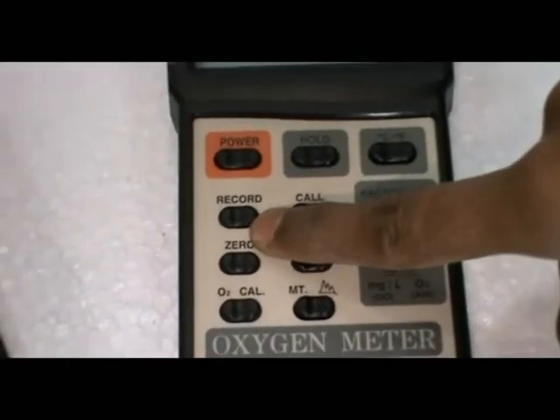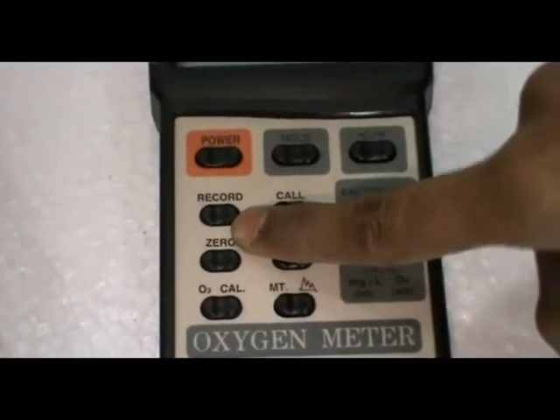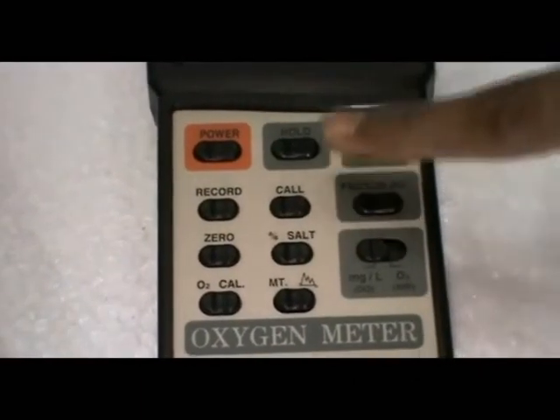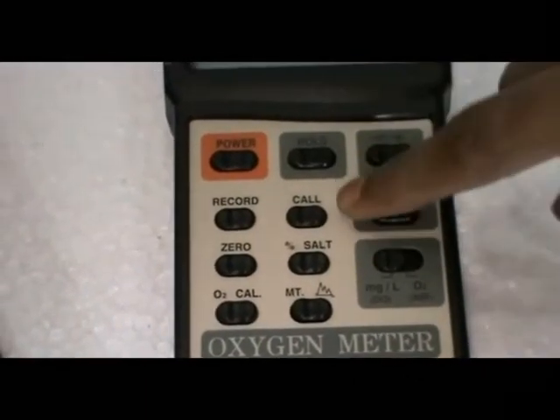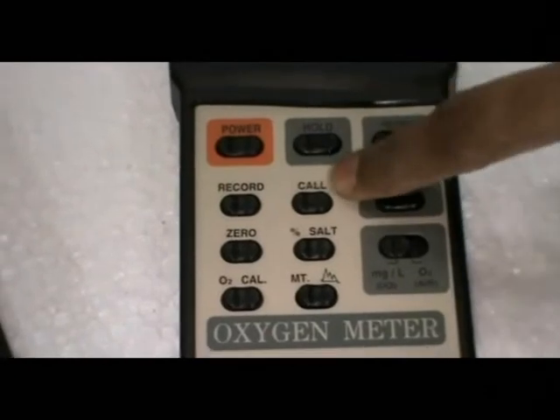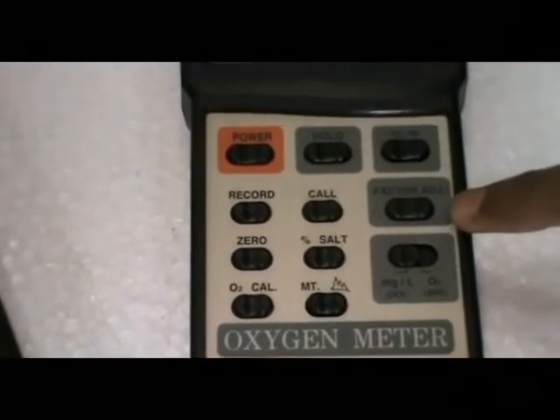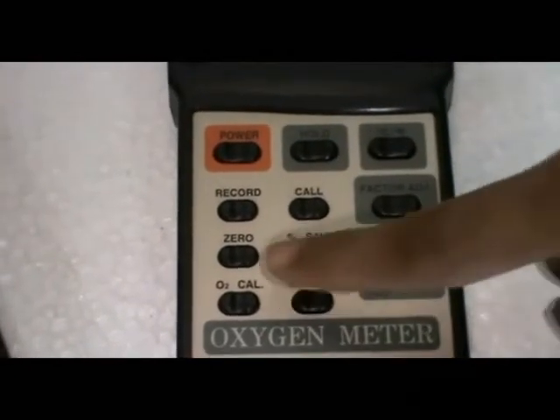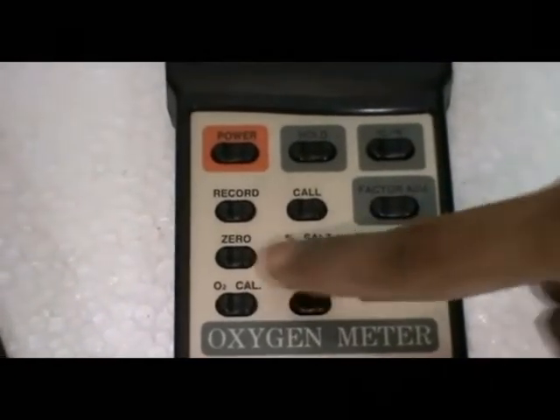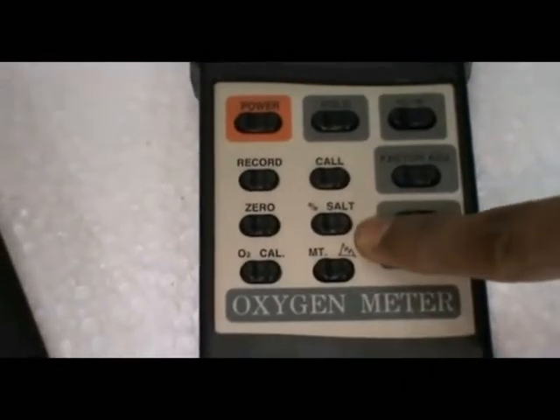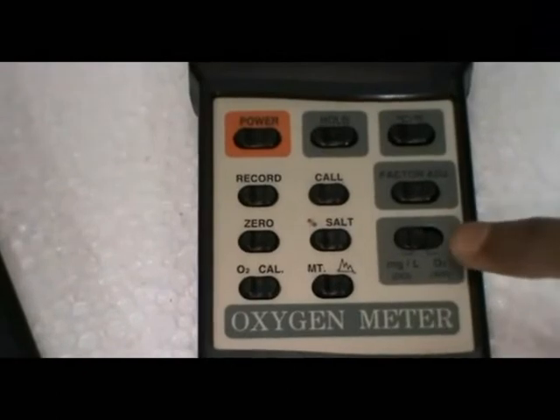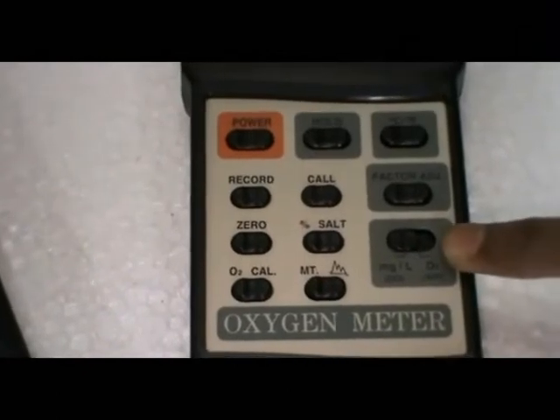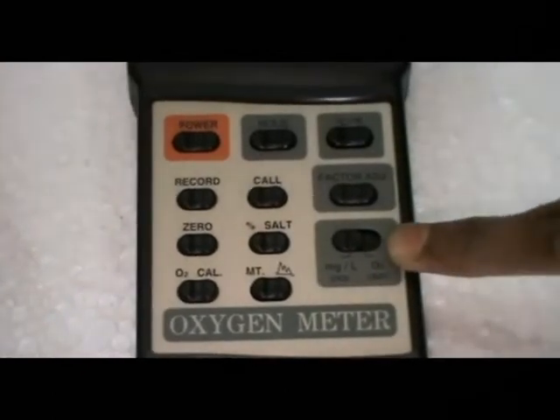Record button shows the last calibrated data. Cal, factory adjustment, zero, percentage of salt, and mode button.